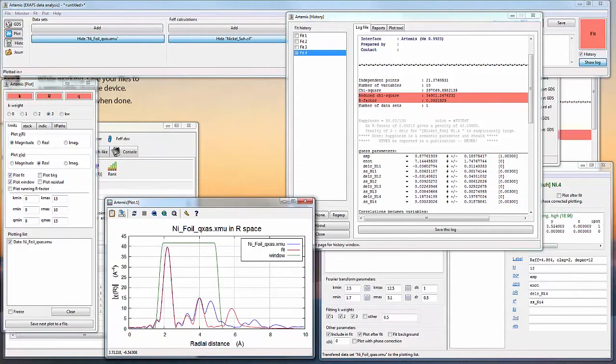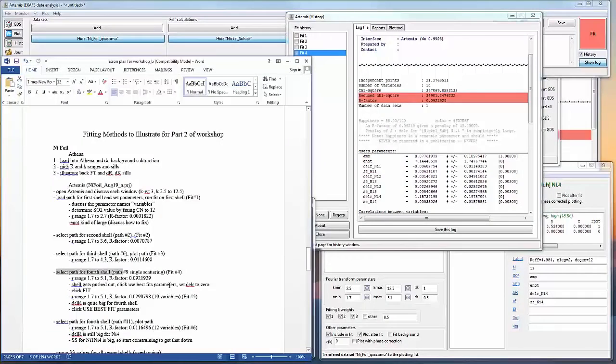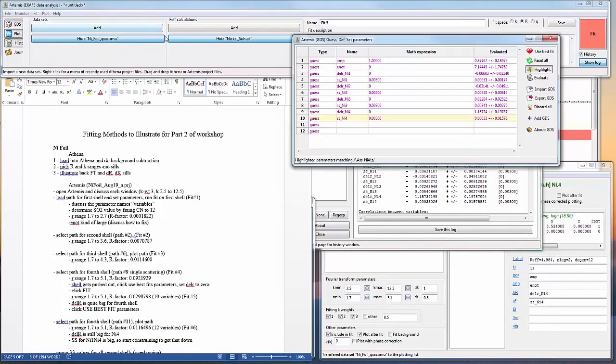And the reason why it didn't like it is because I haven't been using the best guessed fitting parameters for each fit. So what we're going to do is click on our guessed def set list, and every time the fit is evaluated you get the results here.